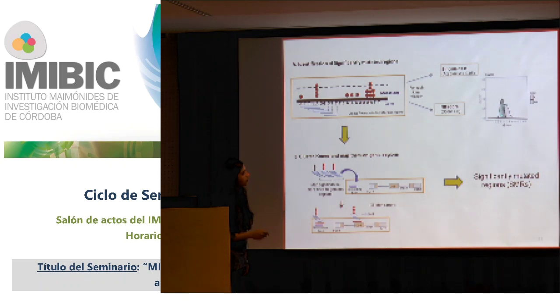We do the analysis. This is from single mutation. So I run the k-mers for just one mutation, and then the k-mer with more than 3 mutations, let's say. And this is the score that we choose as cutoff, 7, because we don't want just one mutation. That's also a bias, if it is present in only one patient, one sample. We want at least this mutation position to be consistent. So everything after 7 is the one that we are interested in. That means they are present in either 3 or more patients.